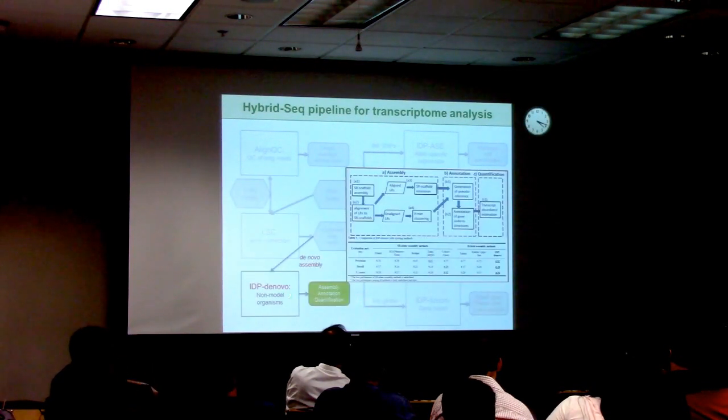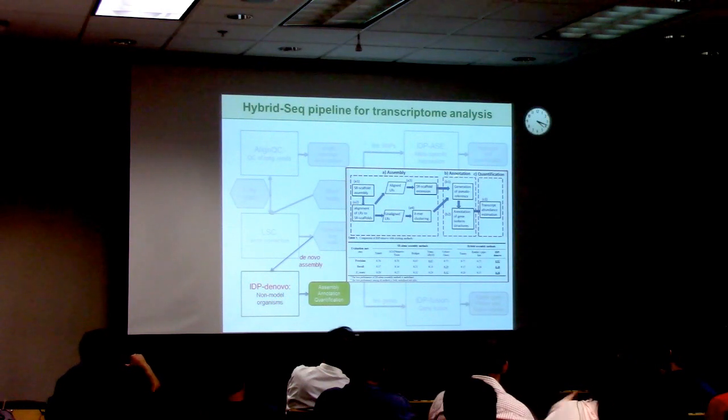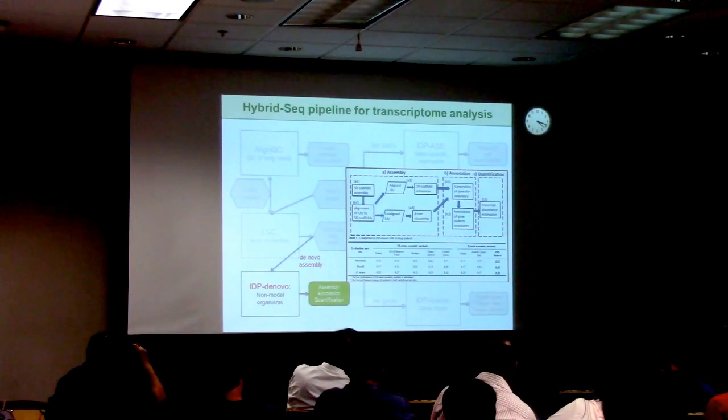And here's IDP-denovo. For non-model organisms, we developed a pipeline to assemble the transcripts, annotate them, and also quantify the transcriptome. Compared to seven other tools, IDP-denovo has better precision, recall, and F1 score. So this is some brief results. It's under review in Bioinformatics now.